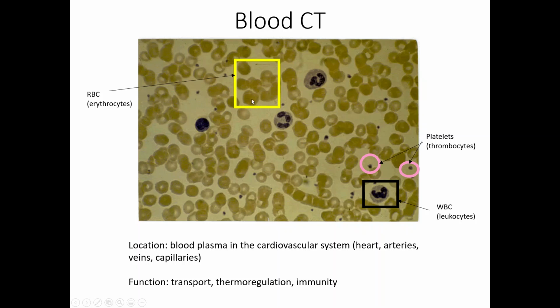They're also a little bit smaller than the white cells, which are not white. They always stain like a purple or a pinkish color, and that's okay. You usually don't see nearly as many white cells compared to red cells. For the time being, we're not going to ask you to distinguish different types of white cells, so you'll notice that this one does not look the same as this one, because they're not. They are different types of white cells. We're just collectively going to call these leukocytes. Okay, and last but not least, the platelets, these tiny purple dots. These are the smallest little components that you see, and they're small and a little hard to see, but they're easy to differentiate between a red cell and a white cell.